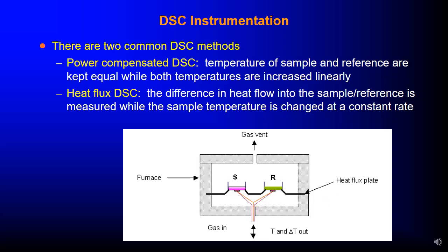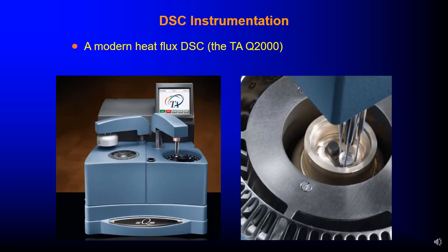So you can see just an example of differential scanning calorimetry instrumentation. This is the modern heat flux differential scanning calorimetry.